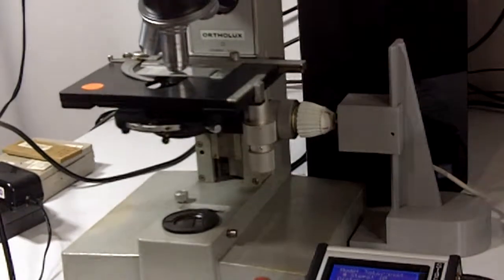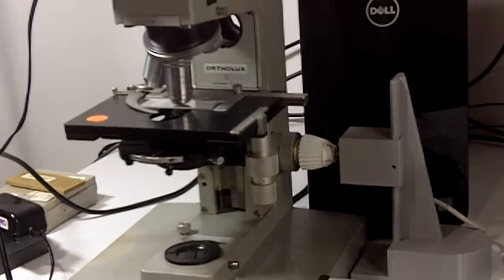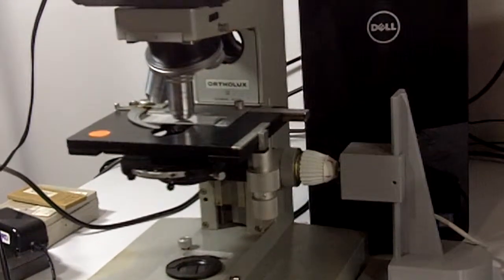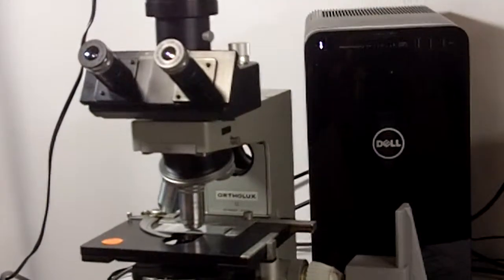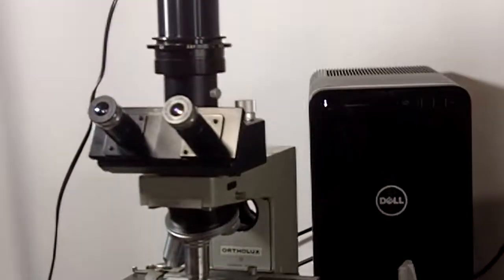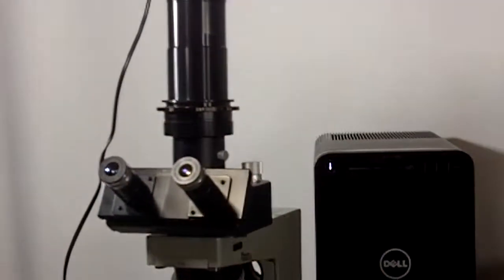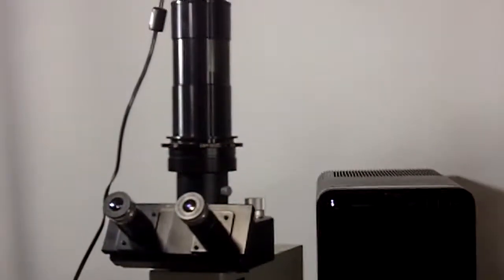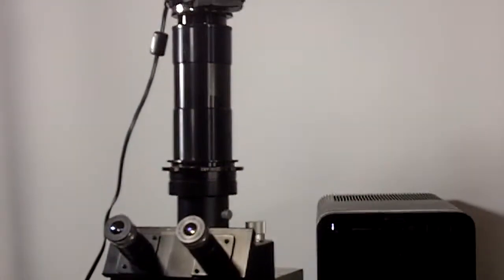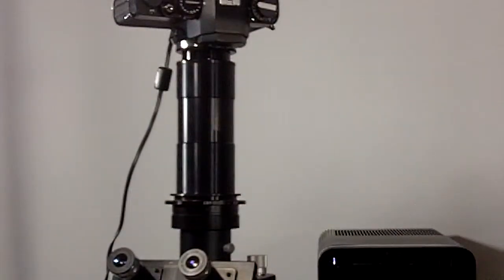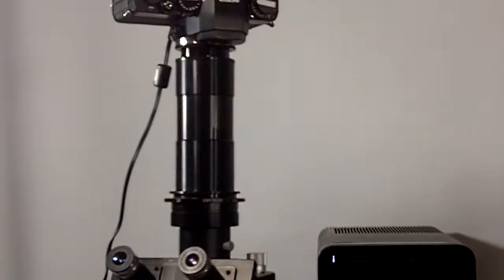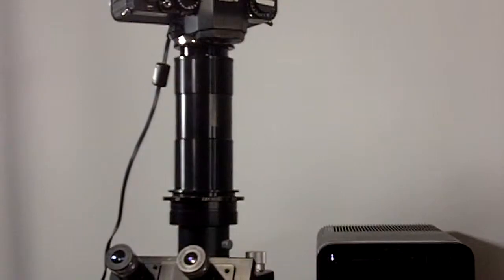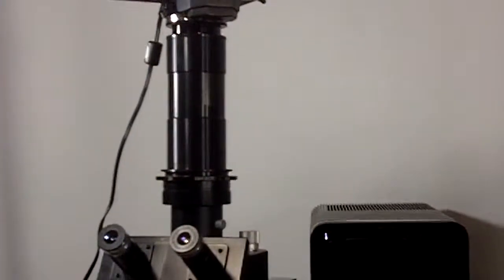Let's review what the system consists of. The total system includes a microscope, of course. Here you see an old Leica Ortholux 2 microscope with a zoom lens, and mounted to the top is a full-frame camera.